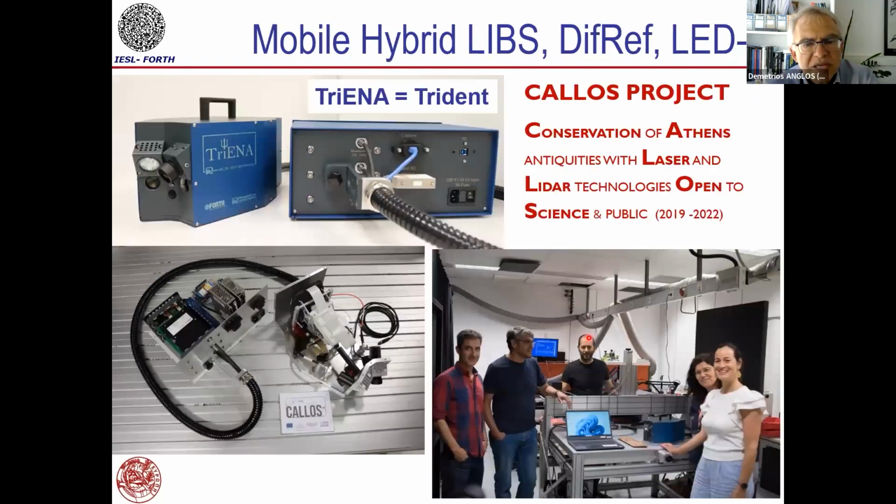So what I'm showing here is the latest achievement of the group. It's a few months old, and what you see on the top left of the slide is actually something that came out of the lab last month, and it's a system that combines three techniques.